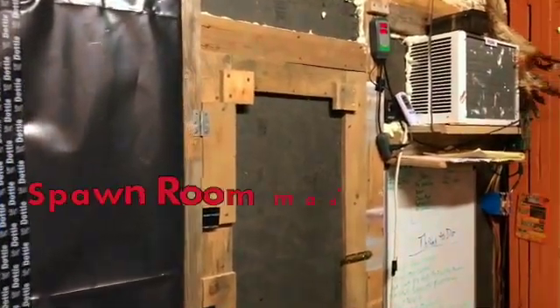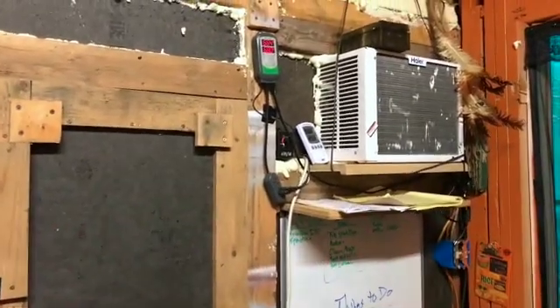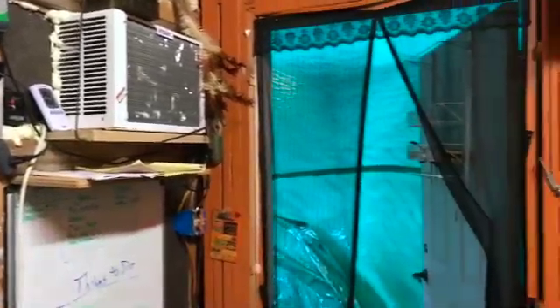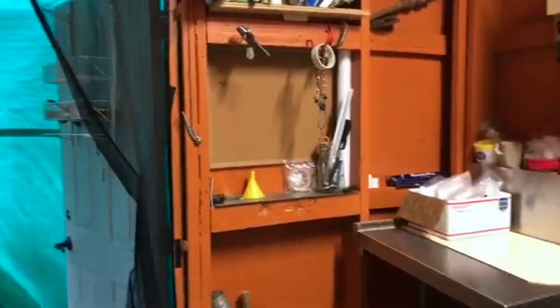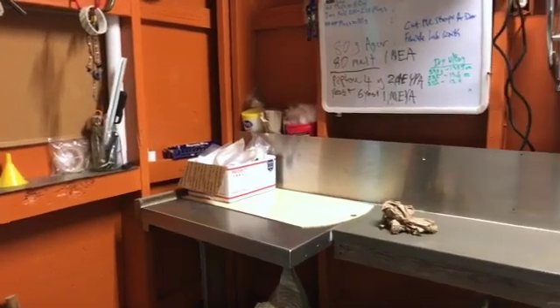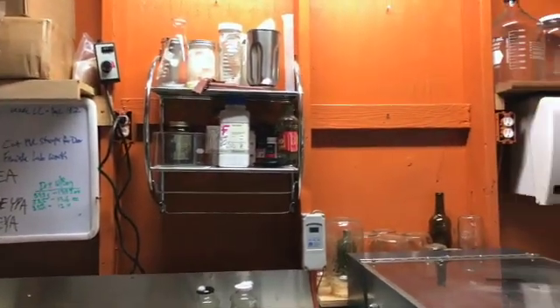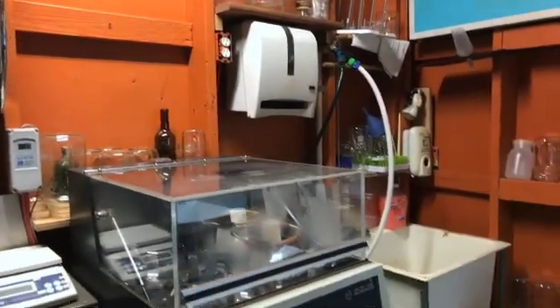We'll go take a look inside there in a second. So our heating and cooling systems for it, and outside, come around — workstation, supplies, and wash station.